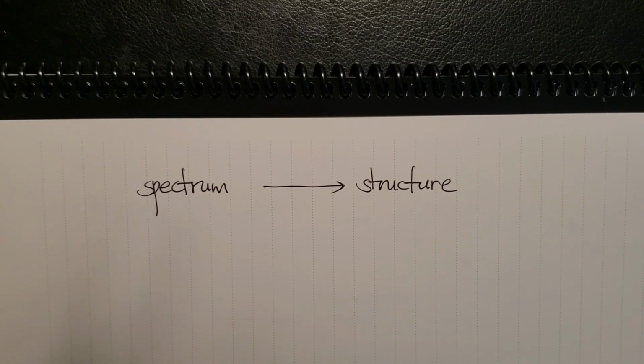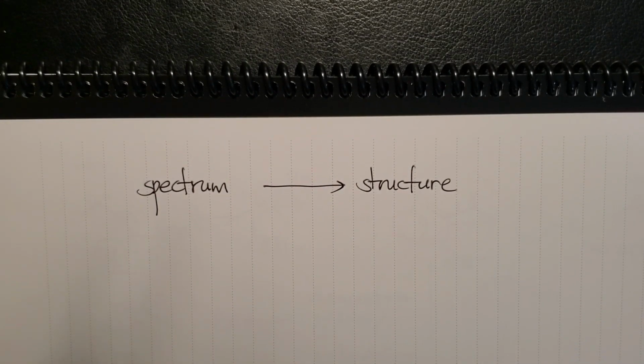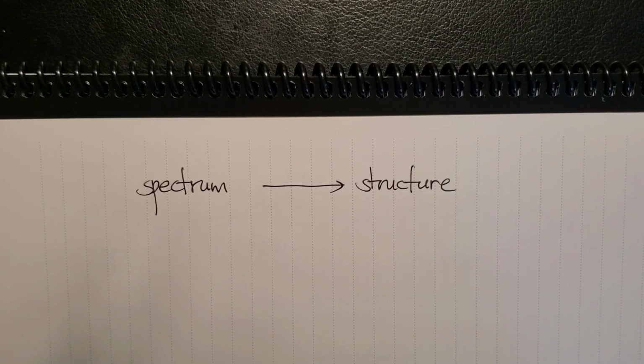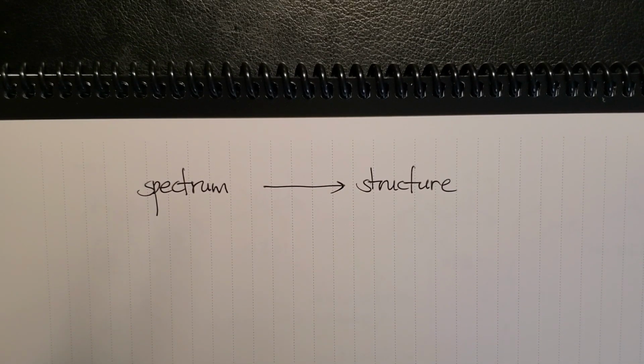So we practiced, when you get the spectrum, how to deduce the structure. Yes, I admit that's the usual case as a researcher, but if you think about it, it's not always the case. If you run an E2 reaction, you are wondering if your base is big enough or not big enough to do Hofmann.